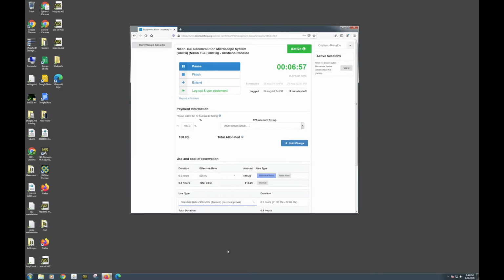After saving your data and closing the microscope software, you will need to go back to the Firefox browser to finish your iLab session. If you have minimized Firefox, click the icon in the taskbar to bring up the window. In the iLab session details, click Finish.